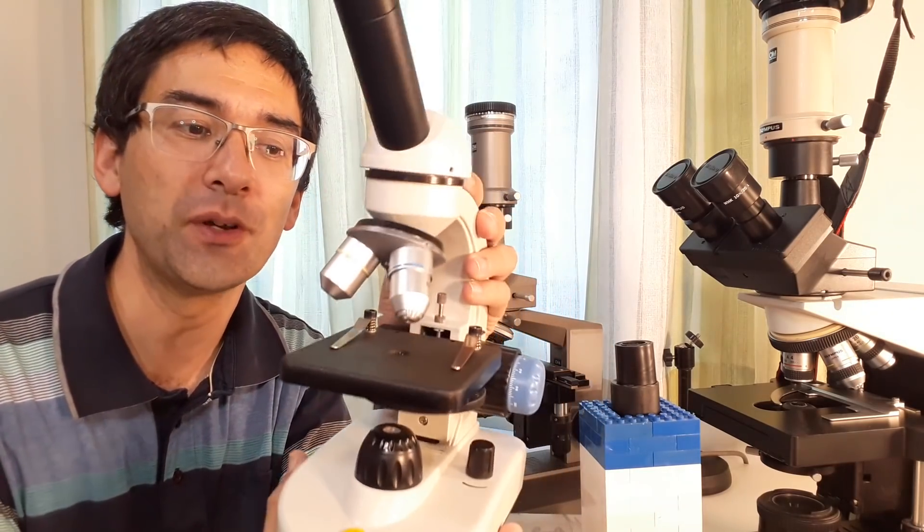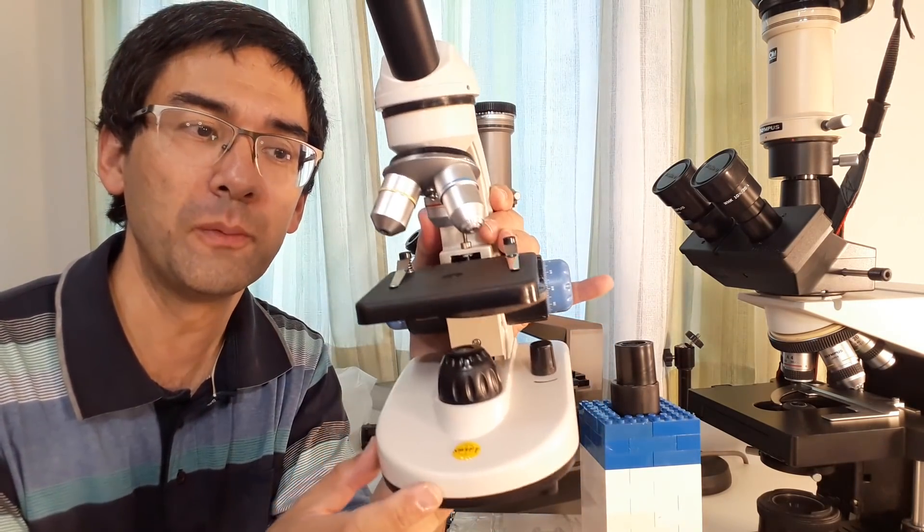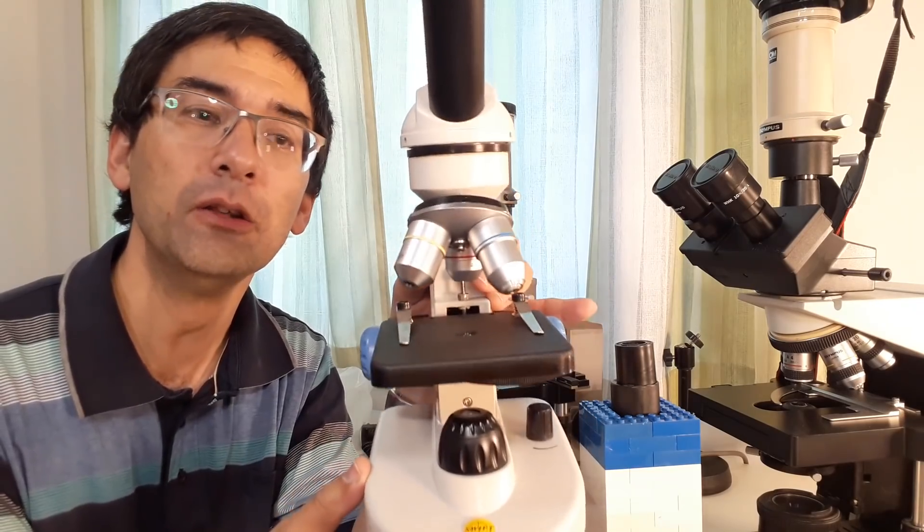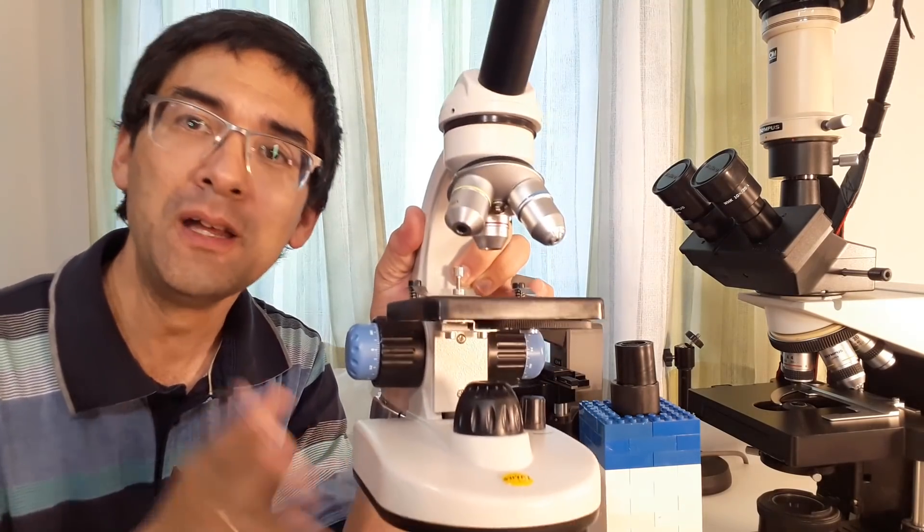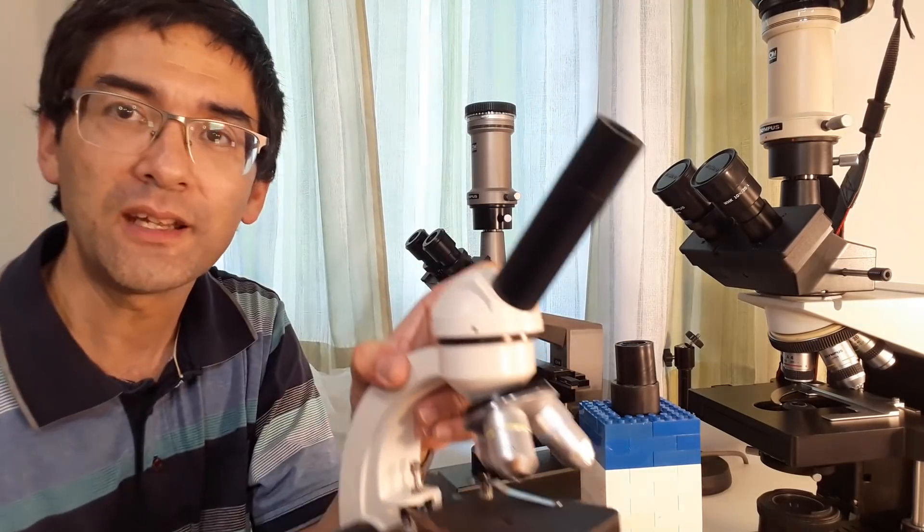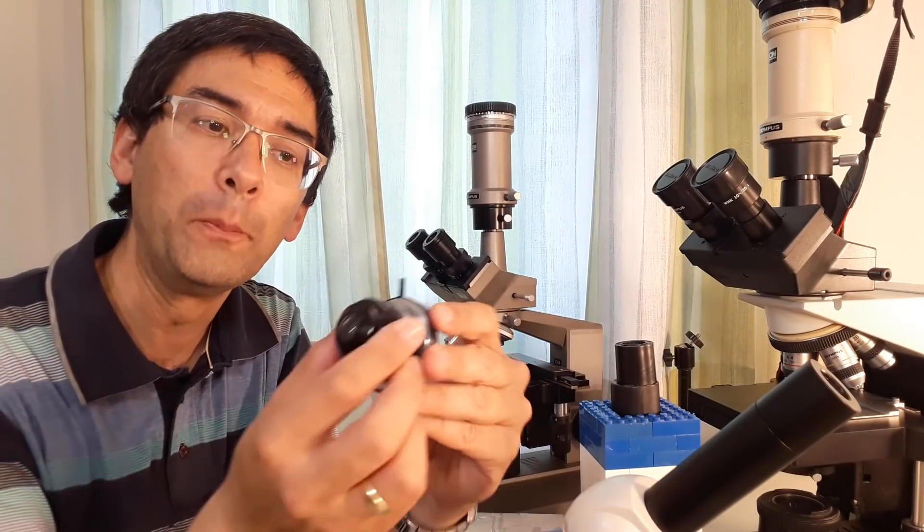So what I have here is, for example, a new microscope from Swift. And this is a very low cost, but very good microscope. I'll be reviewing this one. In the second YouTube channel, I'll also be talking about microscope optics. So for example, this here is a condenser. I'll be explaining the parts of the microscopes.